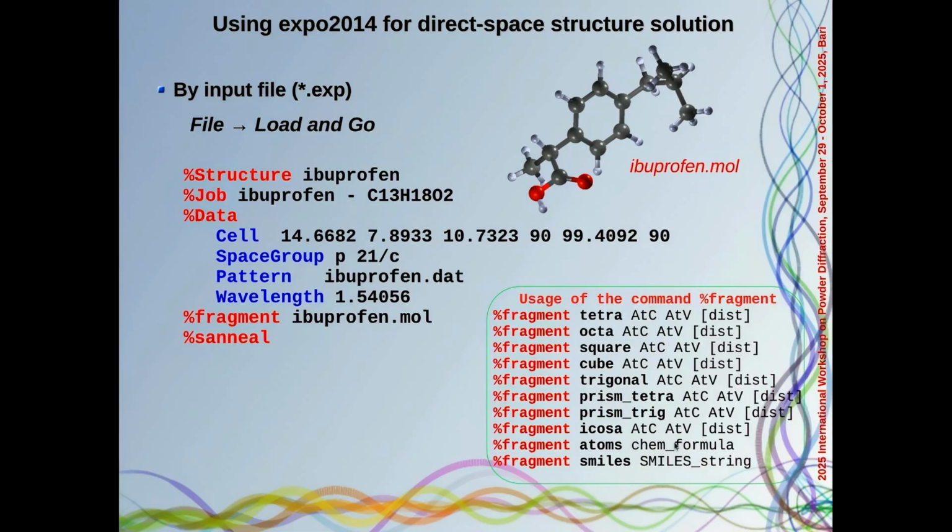For example, if you write O3, three isolated oxygen atoms are imported into the program. Or you can load a model specifying the SMILES string.